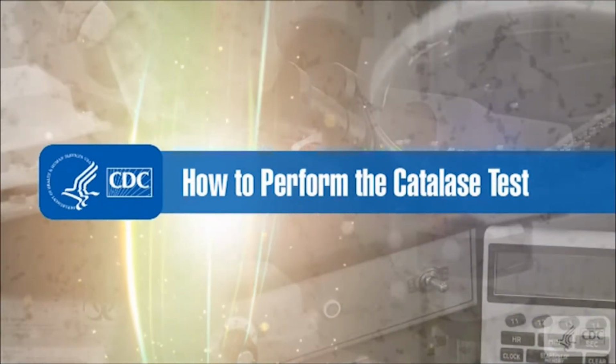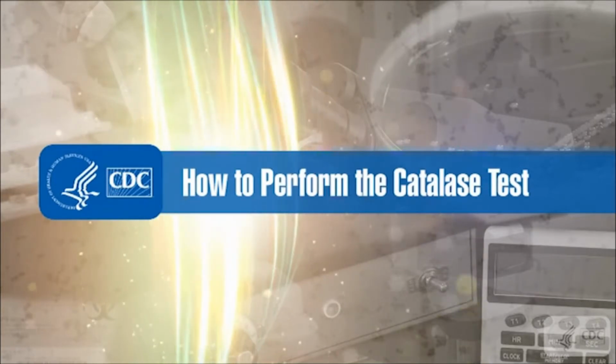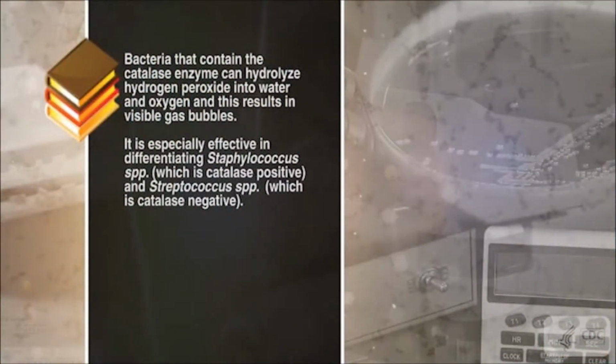Today, we're going to be learning how to do a catalase test. The catalase test is one of several basic microbiological tests used to differentiate bacterial species. How does it do that? Bacteria that contain the catalase enzyme can hydrolyze hydrogen peroxide into water and oxygen, and this will result in visible gas bubbles. It is especially effective in differentiating Staphylococcus, which is catalase positive, and Streptococcus, which is catalase negative.